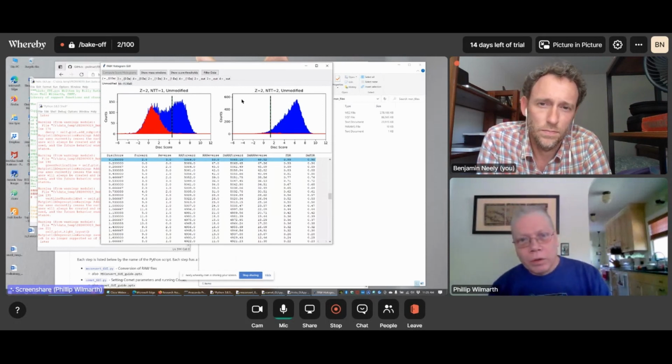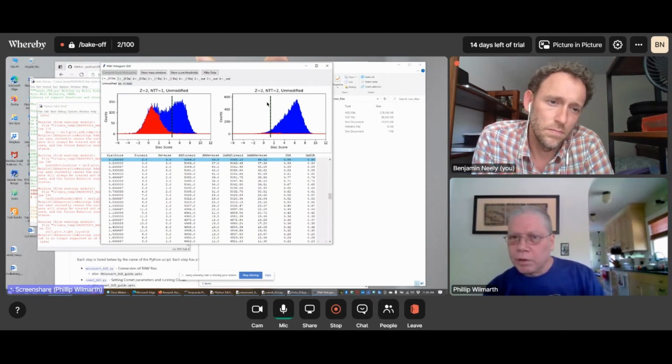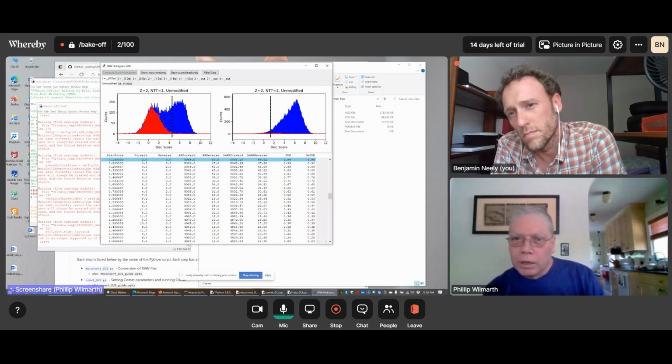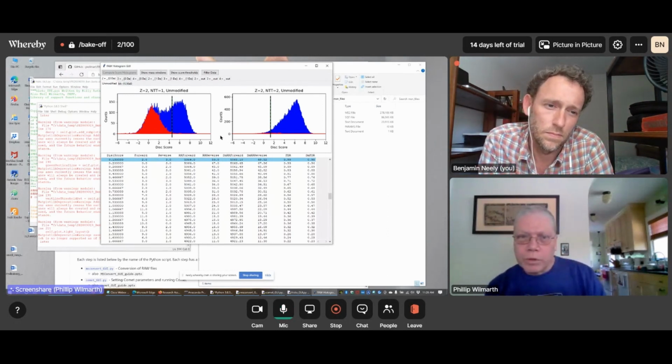So here we also have our fully tryptic peptides and semi-tryptic peptides. This is a search that was done with the semi-tryptic peptides shown, and we see that the fully tryptic peptides in the 0 Dalton region have almost no decoy peptide match. So we can set a very low score threshold and capture nearly all of the correct matches. But the semi-tryptic ones have a bigger search space, they have a lot more decoy peptides associated with them, and we have to set a higher score threshold to get the 1% FDR for that class of peptides. The program here also puts the dotted lines by default at 1% FDR.